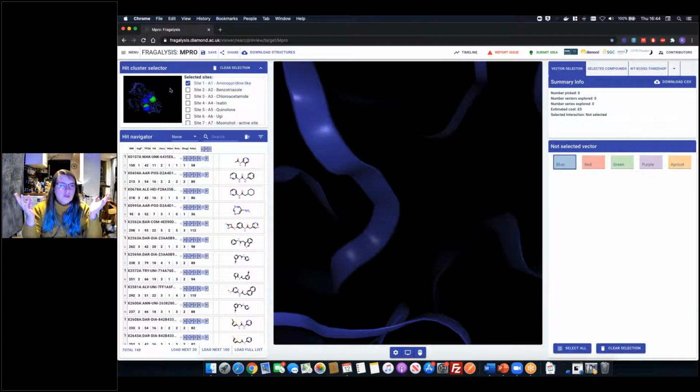It just uses the data to generate a probabilistic model of where they should probably be clustered. So if you had an experiment with a lot of data and weren't sure what your sites were, you might choose to use that algorithm to start to identify different sites and areas of your protein.